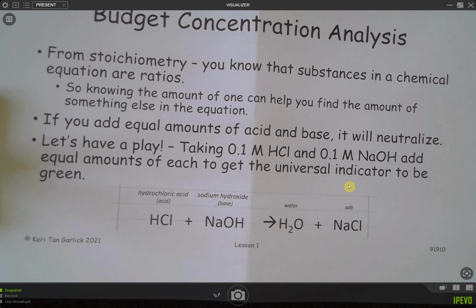We can drink it? No. Well, I mean, yes, you could, but no, you're not doing that, because it's going to be salty anyway. Yeah? So when you do that, you see on these bottles, they're both the same concentration, so it helps balance it. If they weren't the same concentration, then we might need to do twice as much of one thing to balance for the fact that something else is more concentrated. So we're keeping it easy, same concentration.